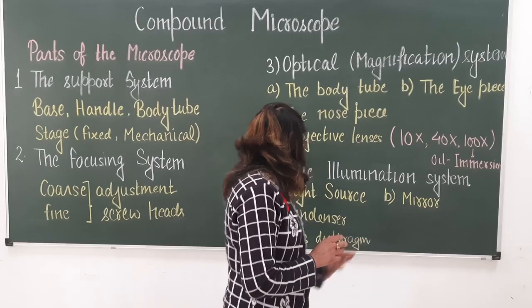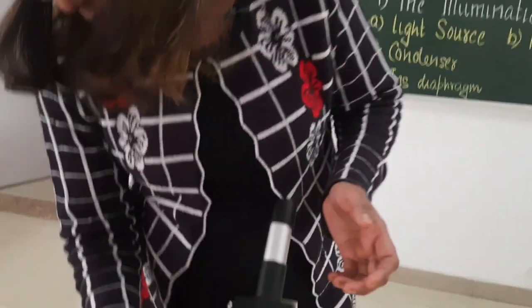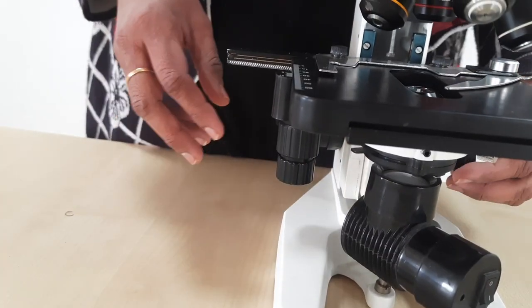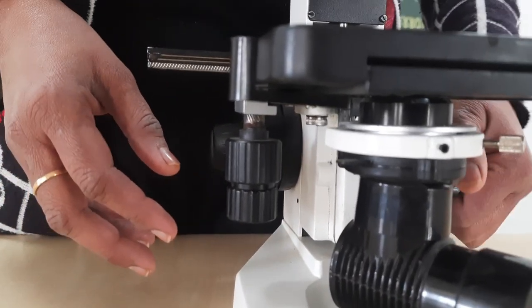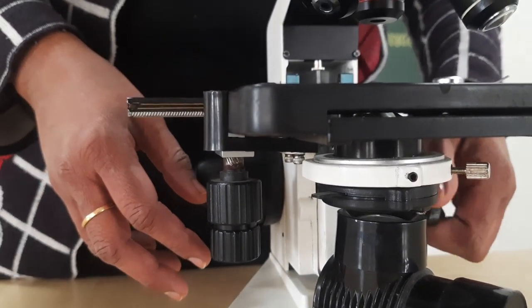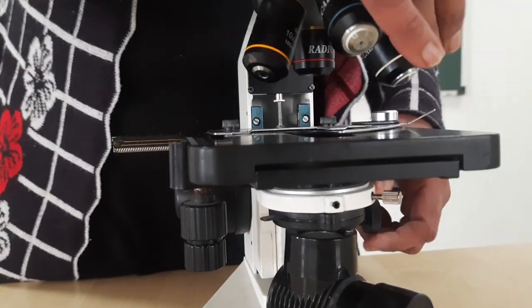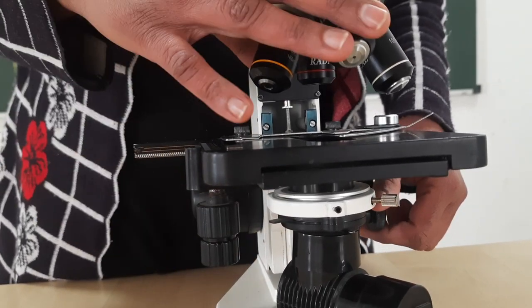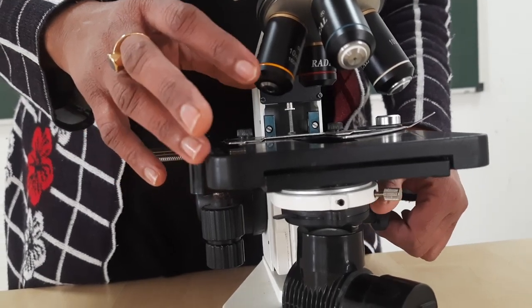Below the stage there is a structure called the condenser, also known as the sub-stage condenser, which moves up and down. When using the 10x objective, the condenser should be in the lowest position; when using 40x, it should be in the middle position.